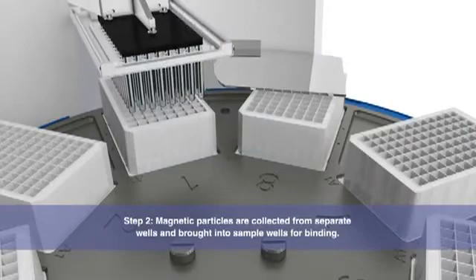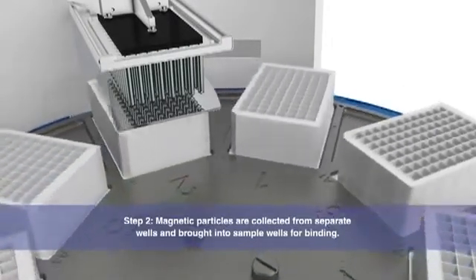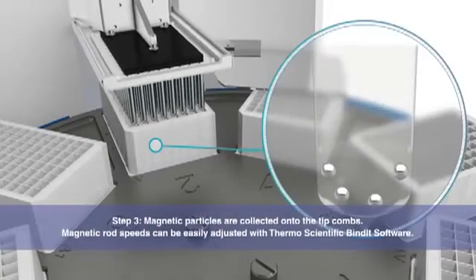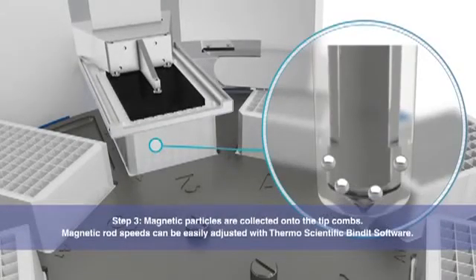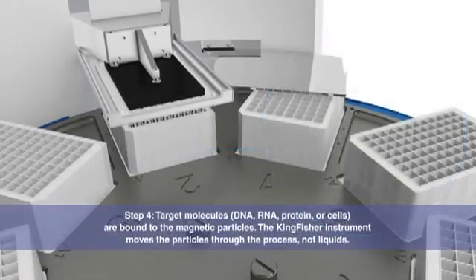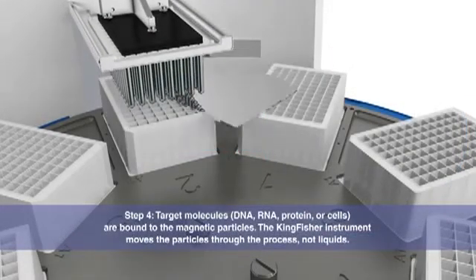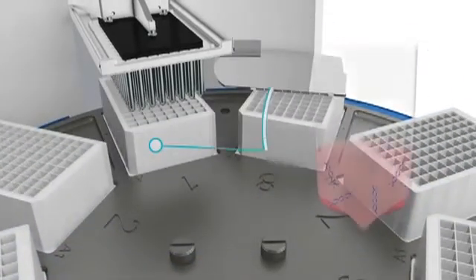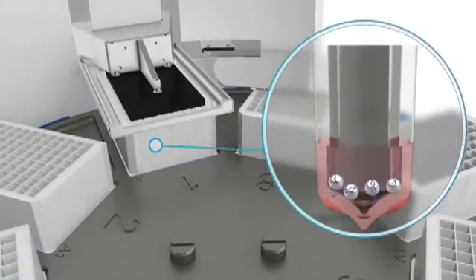Magnetic rods are used to collect magnetic particles on the tip combs. The system can be used to purify DNA, RNA, protein, or cells. In this case, we're demonstrating DNA molecules. The target molecules are bound to the magnetic particles.